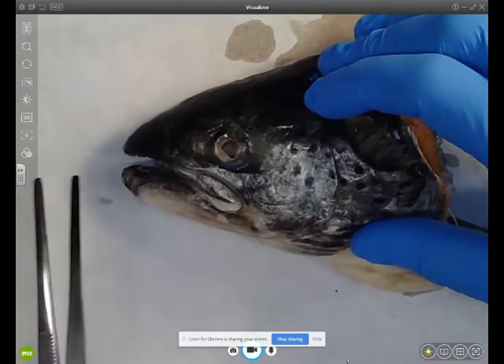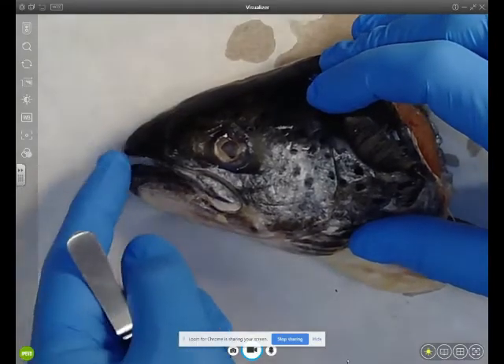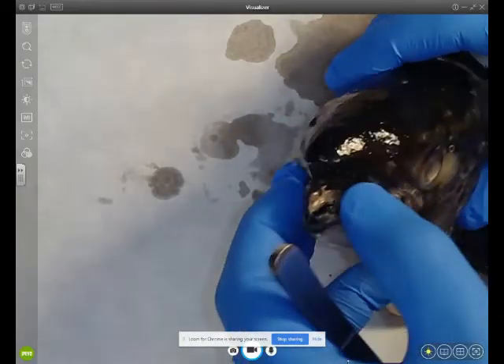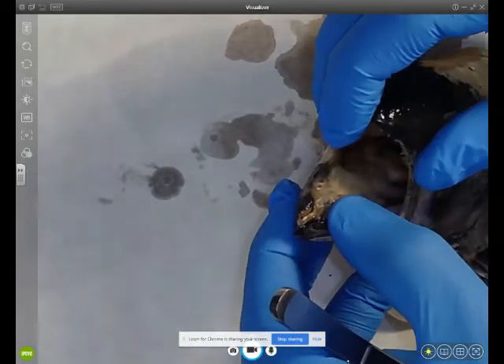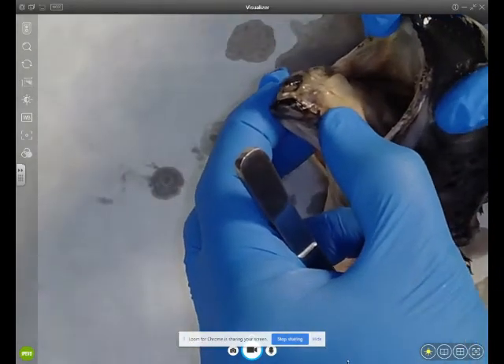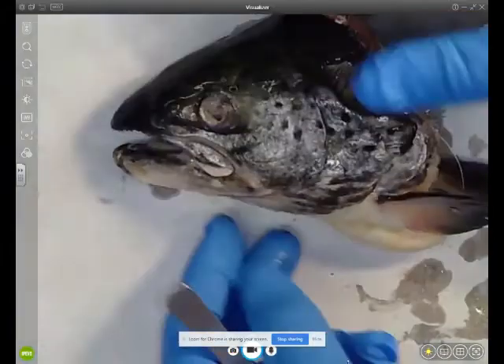With the tweezers I'm going to have a look at the mouth. The mouth is known as the buccal cavity. You can see the teeth, the tongue, and then through into the mouth and at the back the gills.